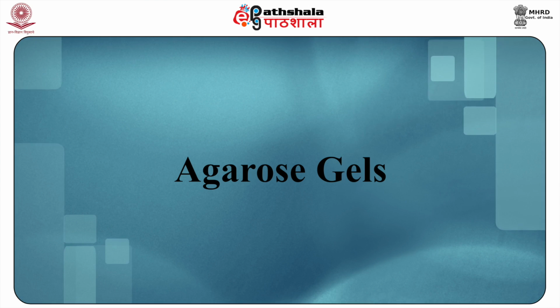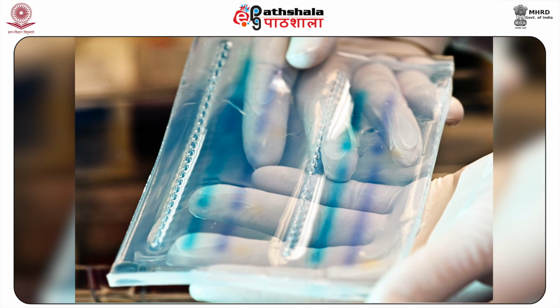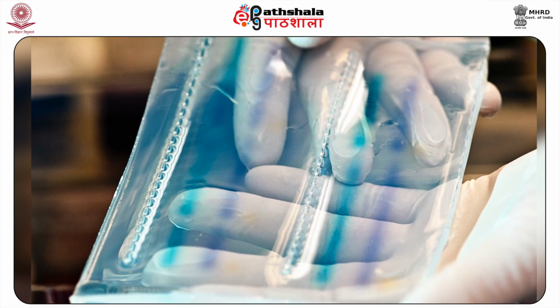Next is agarose gel. Agar is a natural polymer which is derived from seaweeds, Gelidium and Gracilaria species. The purified form of agar is known as agarose, which is extensively used in electrophoretic separations of nucleic acids. Agarose is a biopolymer, a linear polysaccharide which can be melted to cast gels. Agarose upon melting in aqueous phases becomes gelatinous and is used because of its sieving effect in electrophoresis.